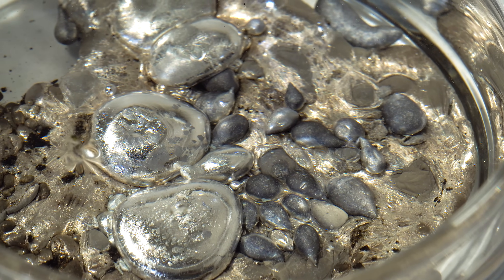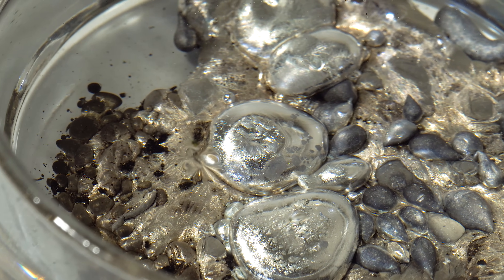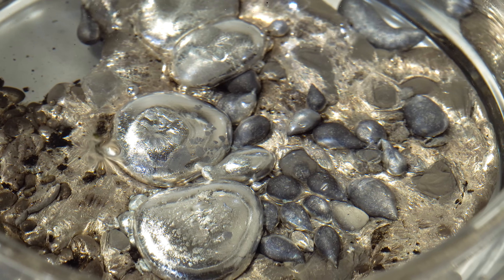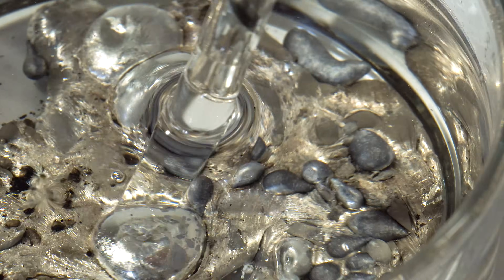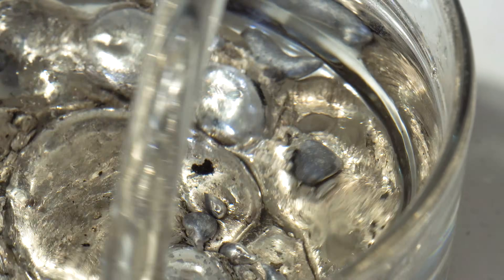Look at how the rubidium sits on top of the cesium – now I'll try to mix them with a glass rod. Despite both of these elements being solid metals at room temperature, gradually I managed to mix them so that they turn into a homogeneous mass.